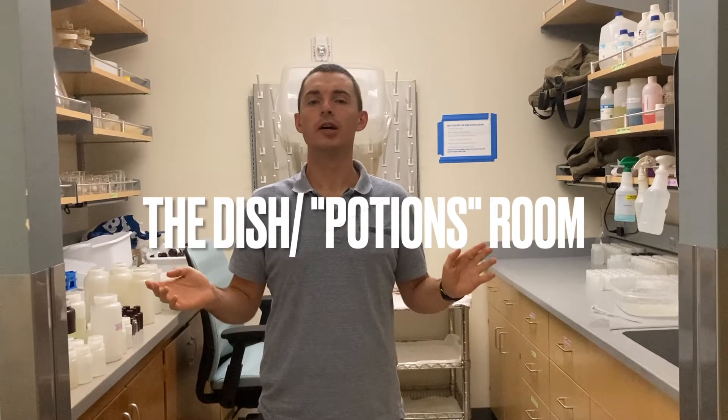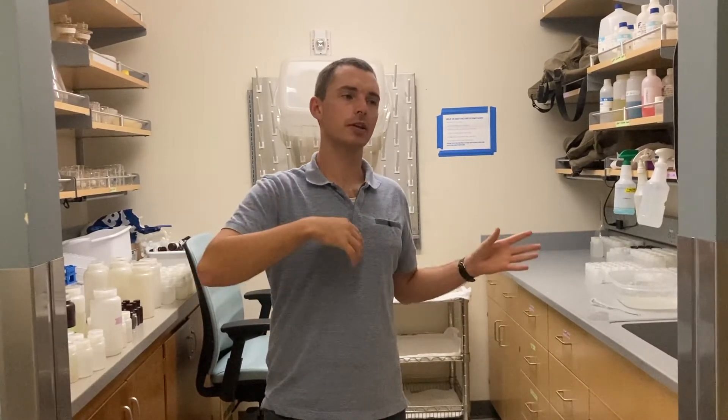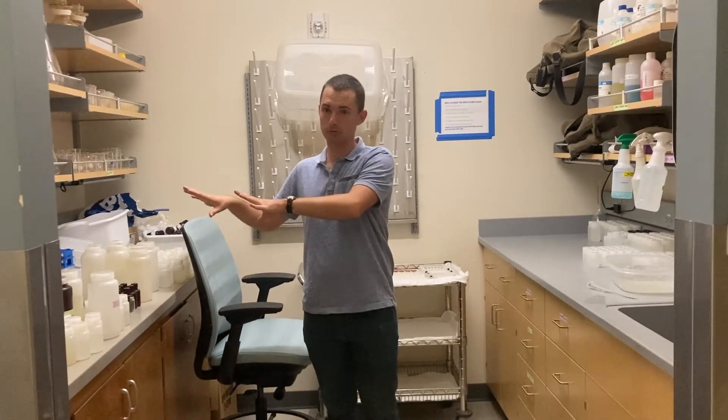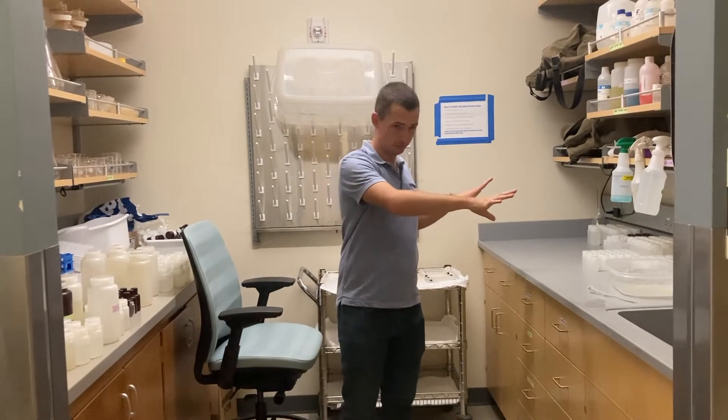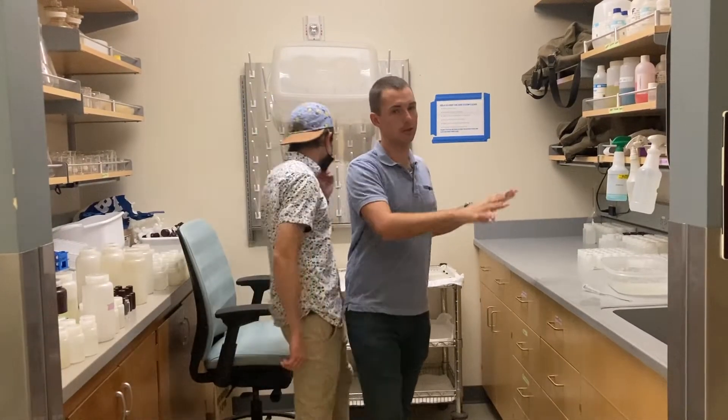Okay, this is the dish room. Anything that we use to sample water — after we're done with it — goes here to be cleaned. On this side of the room is where we put all of our dirty stuff. On this side is where we keep things that are in the midst of being cleaned or are already finished being cleaned.